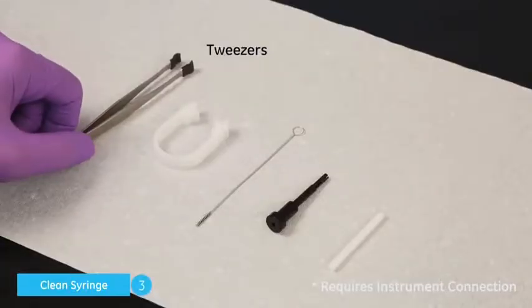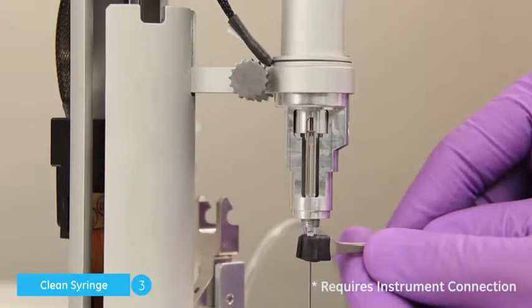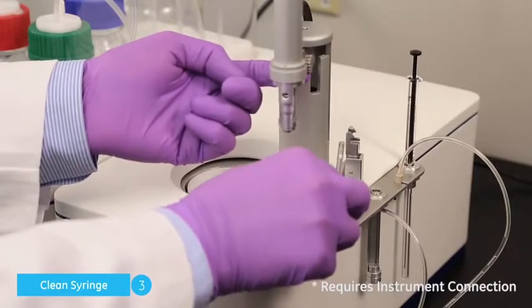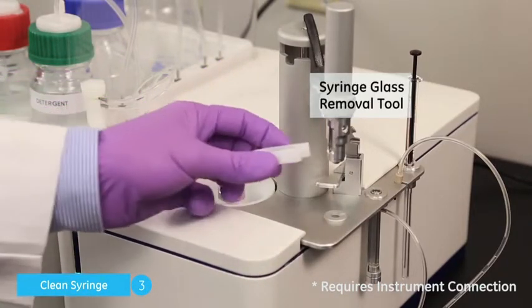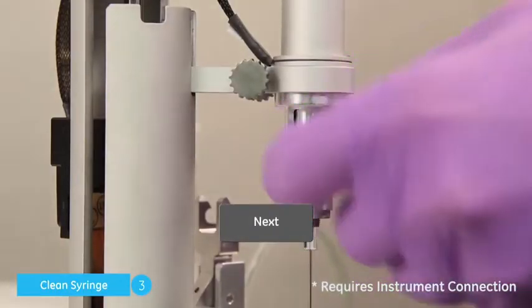Carefully remove the syringe glass using the supplied tweezers. If the plunger motion did not expose enough syringe glass, use the syringe glass removal tool and click Next.